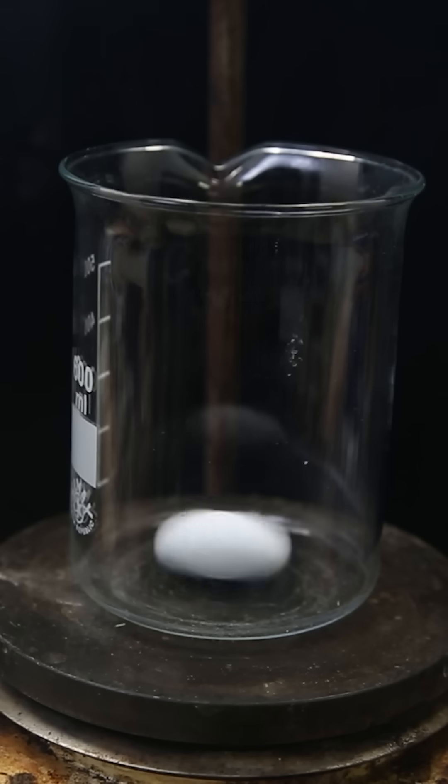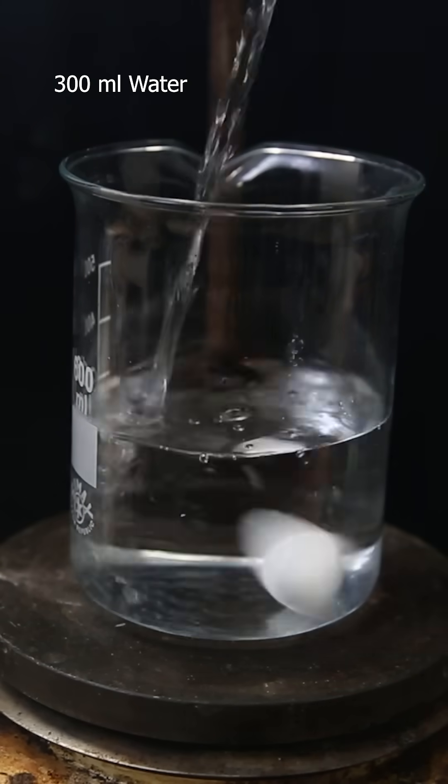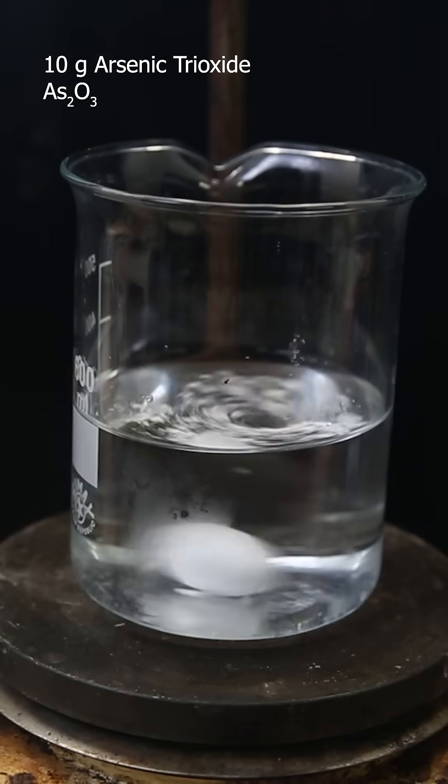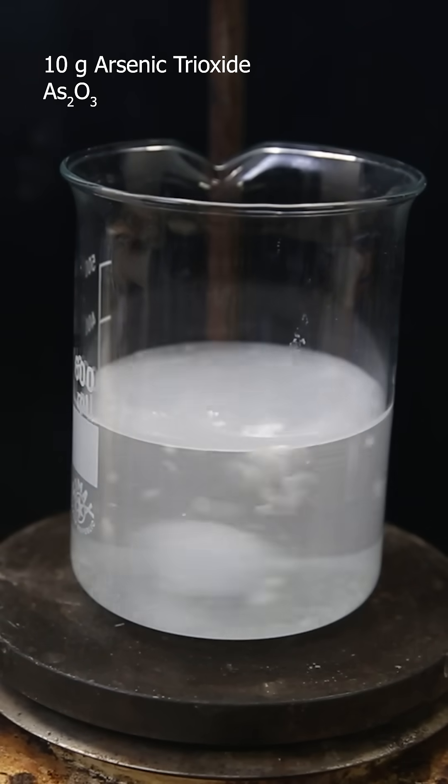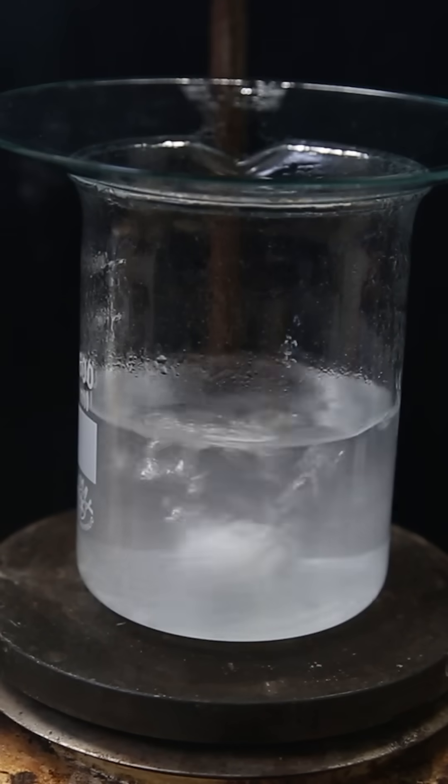First, I set up a beaker with a stir bar and add in 300 ml of water. I start heating it to a boil and then add in 10 grams of arsenic trioxide. After boiling it for more than an hour, it has dissolved.